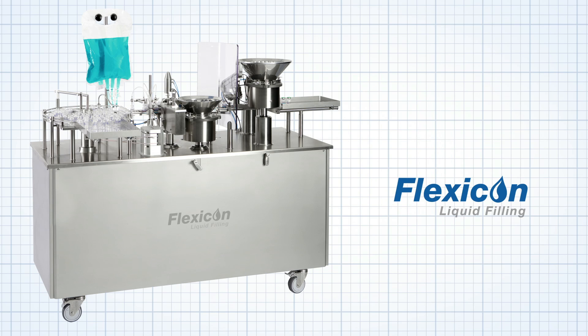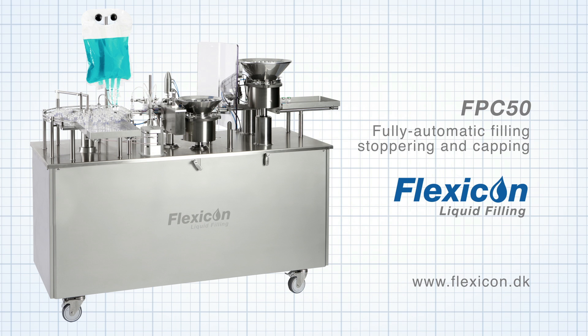The FPC-50 is the perfect solution for small batches at contract fillers and for highly flexible production for clinical trials within R&D departments.